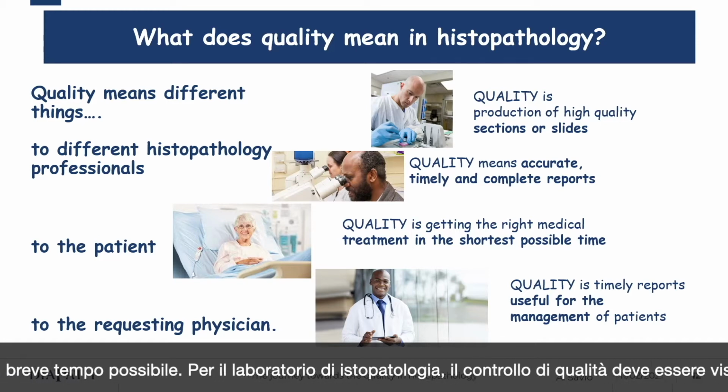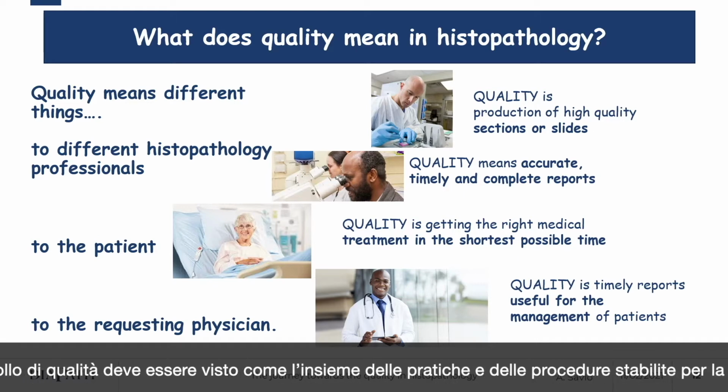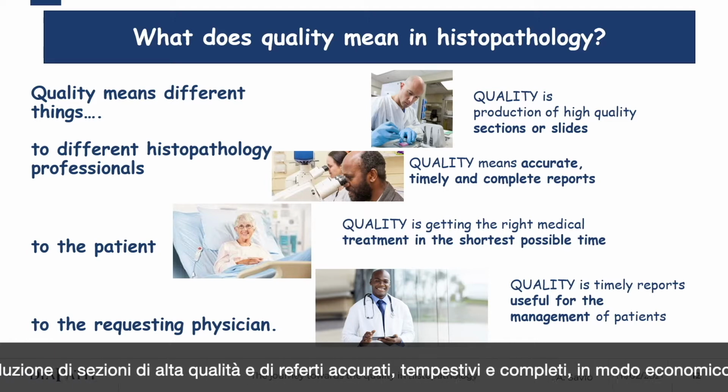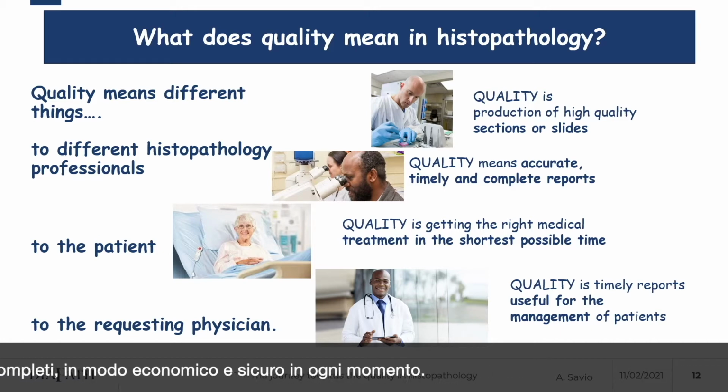For the histopathology laboratory, quality control must be seen as the policies, practices and procedures enshrined for the production of high-quality sections and of accurate, timely and complete reports in a cost-effective and safe manner at all times.